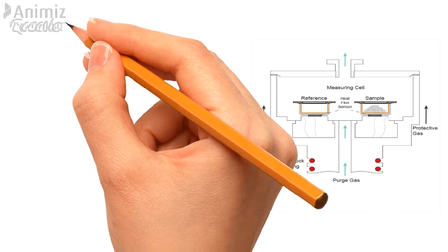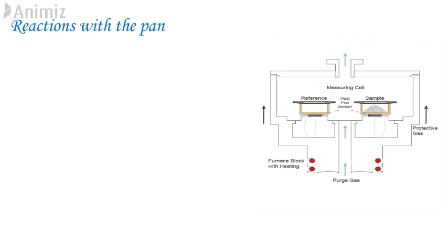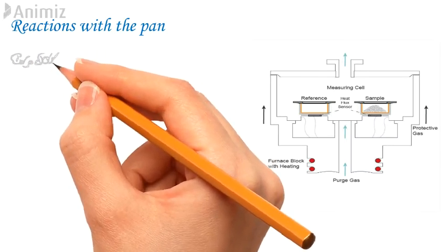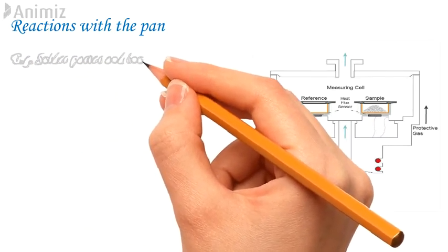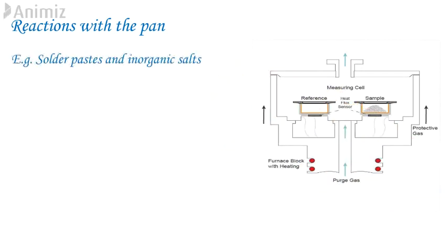4. Reaction with pan. Samples that react with pan can cause serious damage to analyzer since they may also react with furnace beneath. Solder paste and inorganic salts are typical examples of samples where care must be taken. If in doubt check it out separately from the analyzer and then choose a pan type which is inert. For example, sometimes the effect of catalysis is of interest and copper pans may be used to provide a catalytic effect. Aluminum pans are normally made of very high purity metal to prevent unwanted catalytic effects.